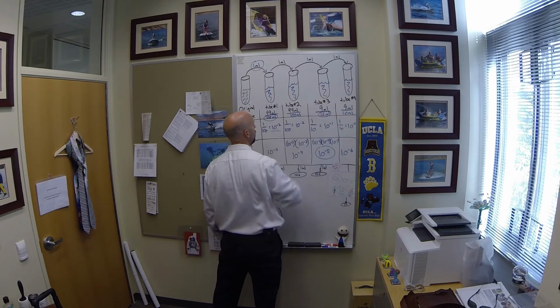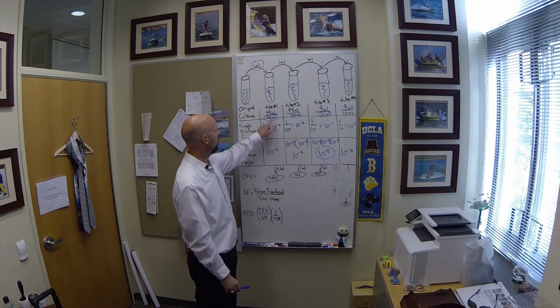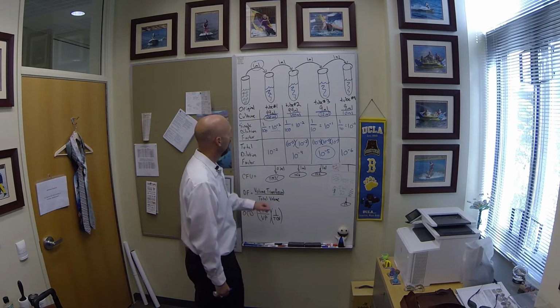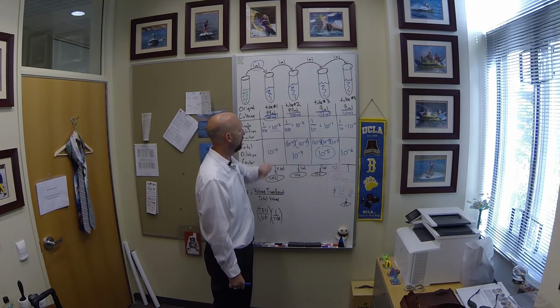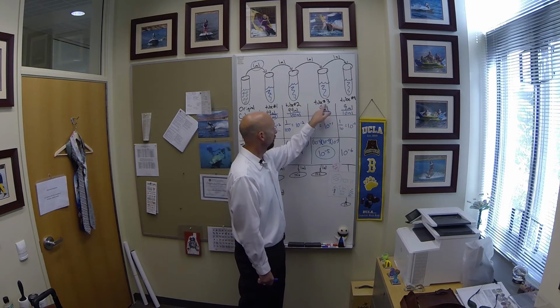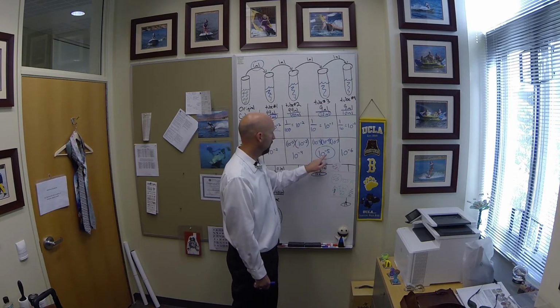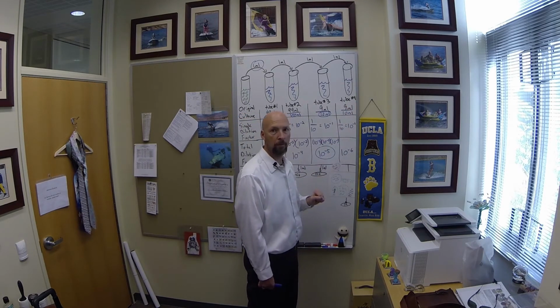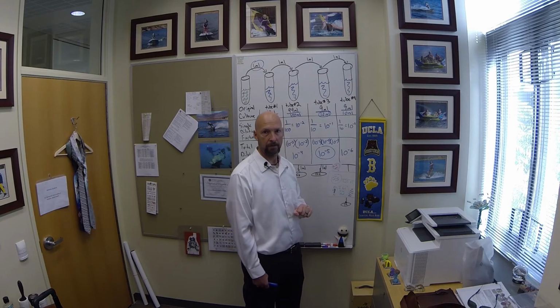in each tube. So what this means is the total dilution factor in tube number 1 is 10 to the minus 2. The total dilution factor in tube number 2 is 10 to the minus 4. The total dilution factor in tube number 3 is 10 to the minus 5. And the total dilution factor in tube number 4 is 10 to the minus 6. Okay?